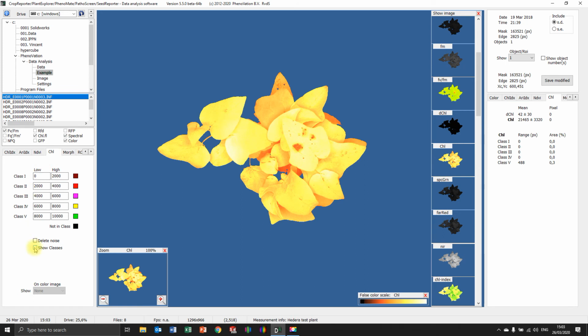And for chlorophyll fluorescence, we can also do that. This runs to 65,000 officially, so it depends a little bit on what the value is, but you can see here chlorophyll is now 12,000, 25,000-ish, 30,000. So per plant, I should look into which value you should use, and that's also to find a good effect.